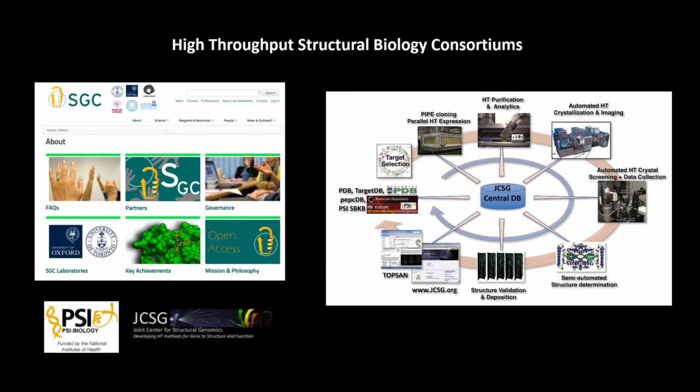Their primary purpose is completely automated crystallography, developing intense, fully automated pipelines that optimize high throughput of every step of the process, from cloning to protein expression to data collection and structure solution, going after numerous targets, often without a specific targeted scientific rationale. They employ large budgets, they have lots of personnel, and tremendous amounts of equipment. And they're producing structural data at a rapid pace.